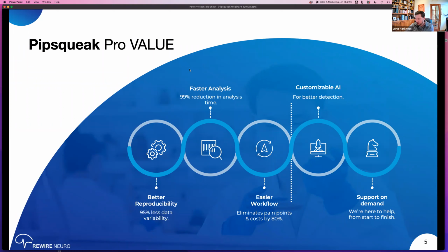Here, our AI models are able to detect the cells in an image and produce a quantification result within fractions of a second. And you'll see how much faster that is even now. Comparing this back to the 15 to 30 minutes it would take me to analyze an image by hand in ImageJ, this is a no-brainer. It's awesome. And ultimately that saves the lab money because we are doing this faster. We're repeating fewer experiments because of sloppy analysis. And so that's a really good win for everybody.